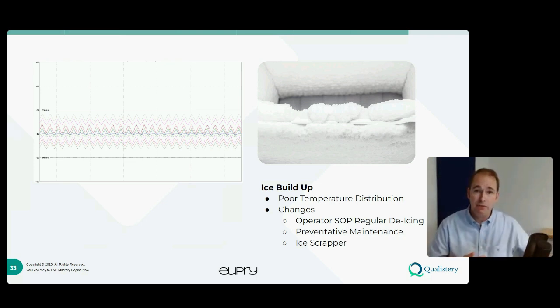If we have buffering on that probe and we had a time delay, it would take a long time before we would get an alarm saying that unit's out of tolerance. So really, there's no hard and fast answers on that. We need to look at the product that's being stored within there and the criticality of it. If it's very low volume and very critical product, you want that alarm to go off as soon as possible. So we want to open that door and that alarm to shoot out.